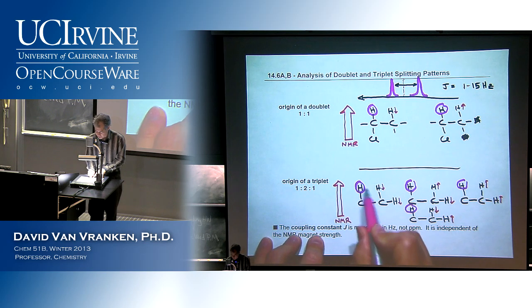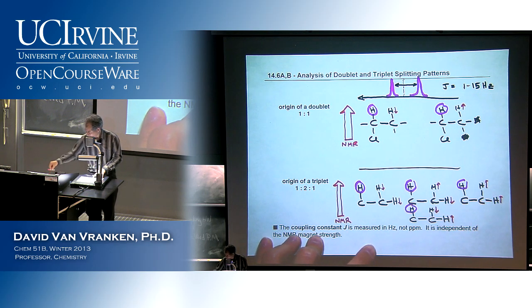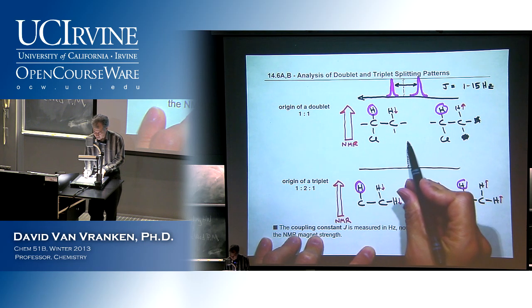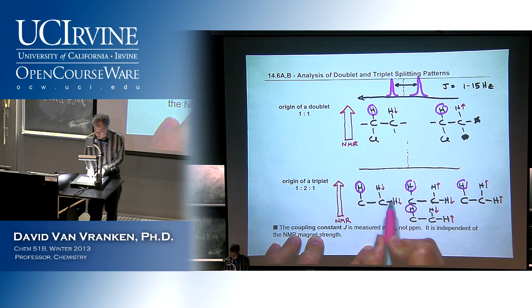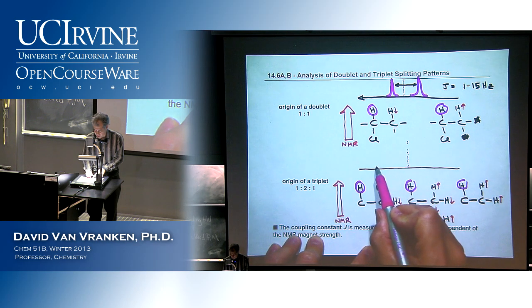So the circled pink proton here, instead of looking like one peak, will look like, let me just draw a little midline here, so I could see what that pink proton would look like if there was no neighboring proton. So one possibility is that these two protons are subtracting. One possibility is that these two protons are significantly adding. And then the middle possibility is that they're canceling each other out.